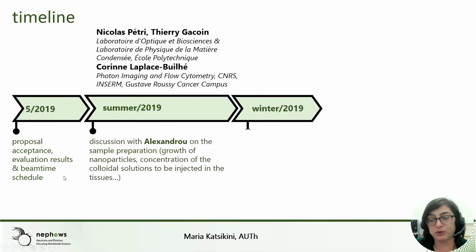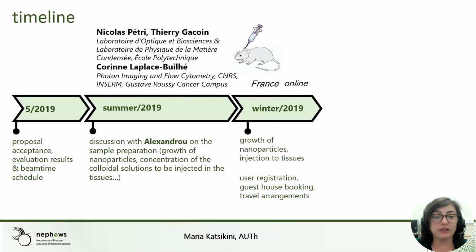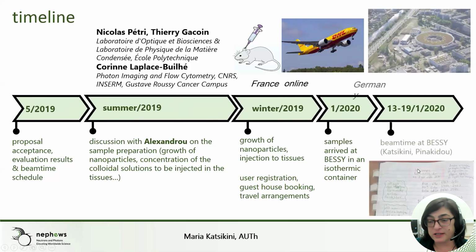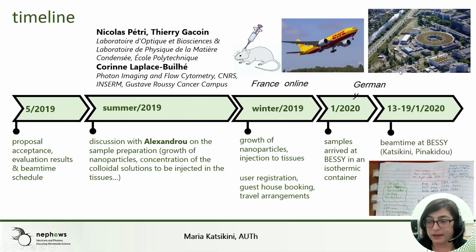Then from summer to winter 2019, we had to discuss which kind of tissues we are going to study and which concentrations of the nanoparticles. We had to do the user registration at BESSY to make all the travel arrangements. And the samples were express-mailed from France to Germany. They just arrived the first day of the beam time.